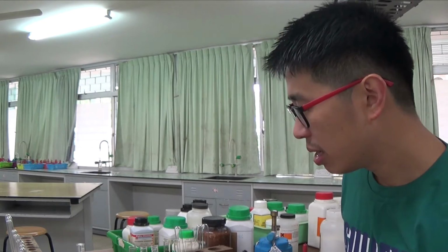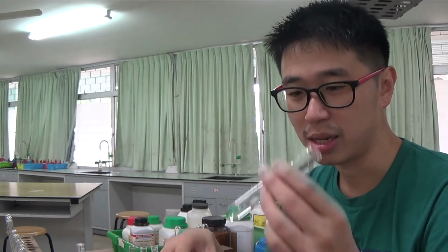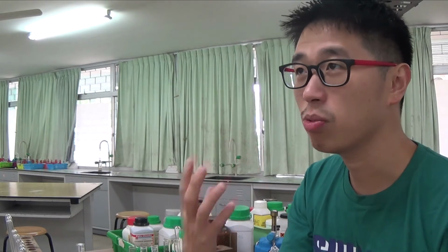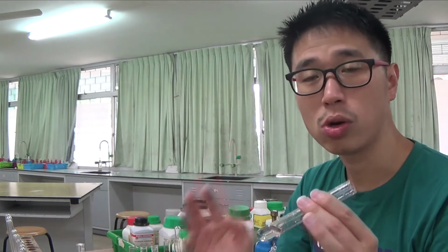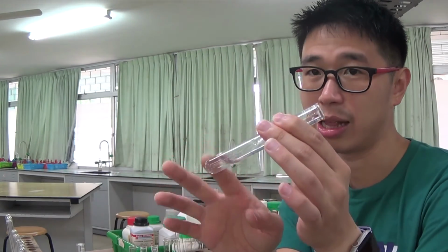If there is no carbonate, can there be a halide such as chloride, bromide, or iodide? This solution is colorless. It tells me that there are no transition metal cations, but of course some colored complexes are very difficult to see because they are a mixture or they're very dilute. Obviously something which is colored tells you there's a transition metal present, but sometimes it's difficult to see because of concentration, or because of other things behind it as well as a mixture. So we are sure there was no carbonate. There's no CO3 2- because there was no effervescence when I added acid to this colorless solution.